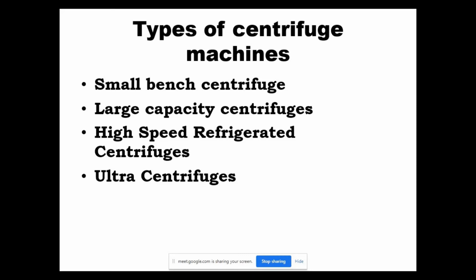Then thereafter we have the high speed refrigerated centrifuge machines. Now you see the high speed centrifuge. Sometimes we use a centrifuge machine where the speed of the centrifugation is very high, or the RCF is very high.